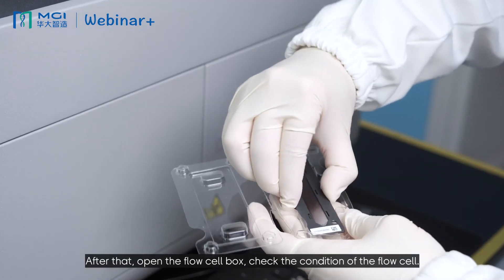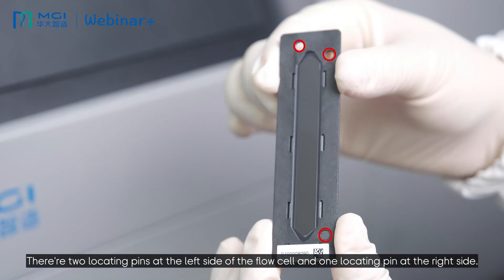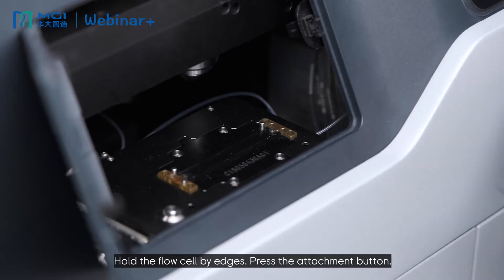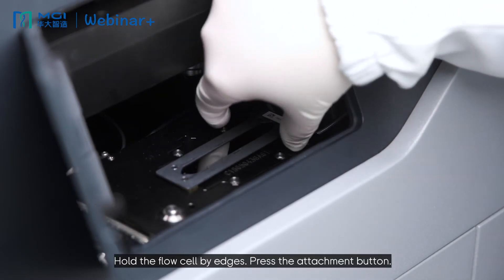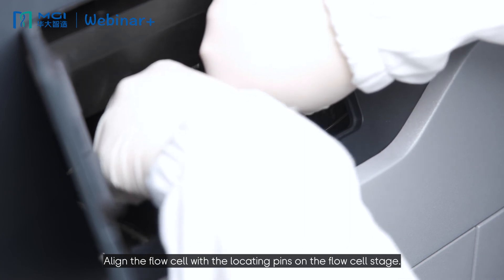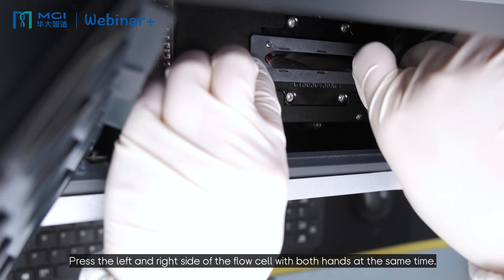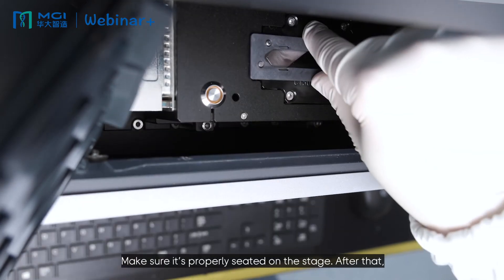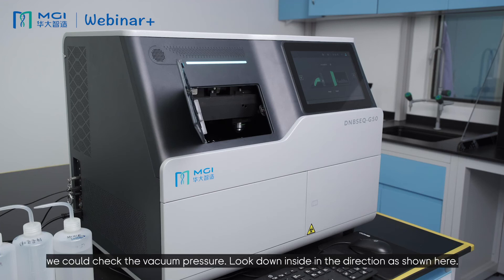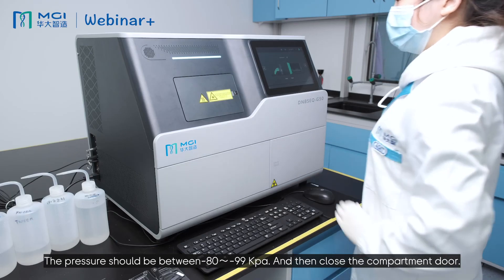After that, open the flow cell box and check the condition of the flow cell. There are two locating pins on the left side and one locating pin on the right side. Hold the flow cell by its edges, press the attachment button, and align the flow cell with the locating pins on the stage. Press both the left and right sides of the flow cell simultaneously to make sure it is properly seated. After that, check the vacuum pressure by looking down in the direction shown — the pressure should be between minus 80 to minus 99 kPa. Then close the compartment door.